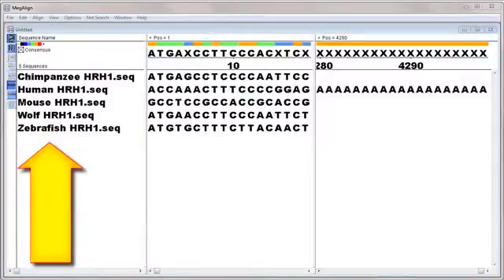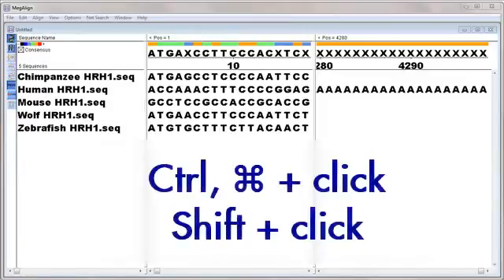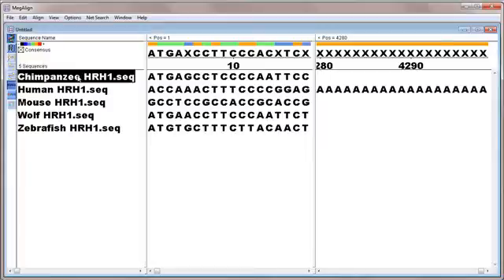In this example, I have already entered several histamine receptor DNA sequences from different organisms. MegAlign's four pairwise alignment methods are disabled until we select at least two sequences by Control or Command clicking, or Shift clicking on their names in the work table.